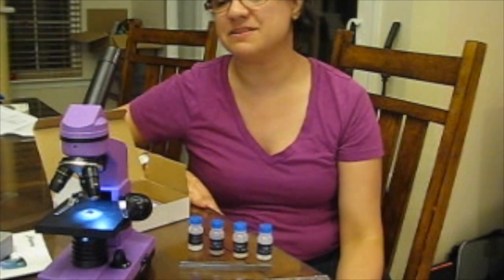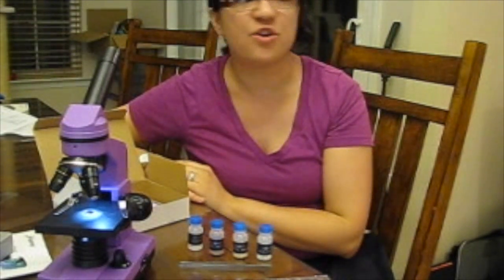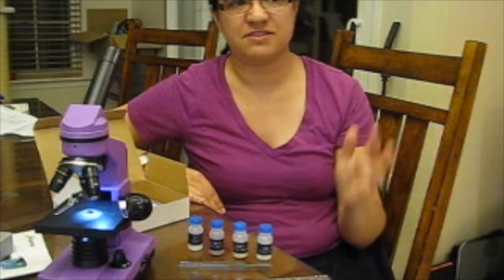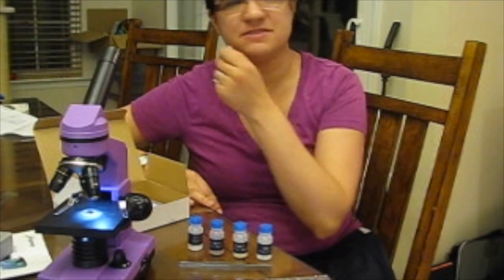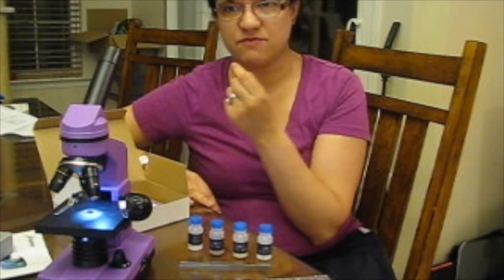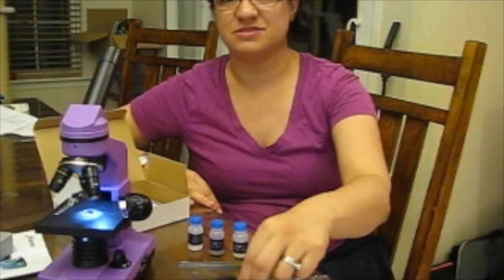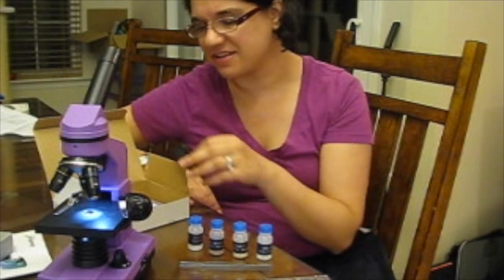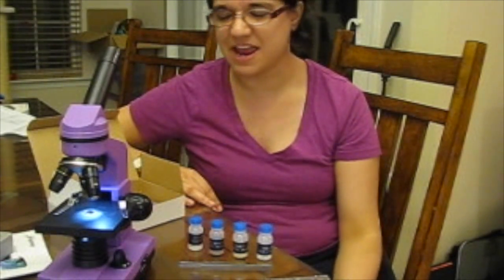And you can also do things as simple as putting a piece of hair under here. We've also looked at our cat's fur and just all kinds of little things we can find around the house. So a tiny piece of like a napkin that's extremely thin. So you don't always have to use the tool to start cutting things, or you can find things around your house that are suitable to look at in their current state.